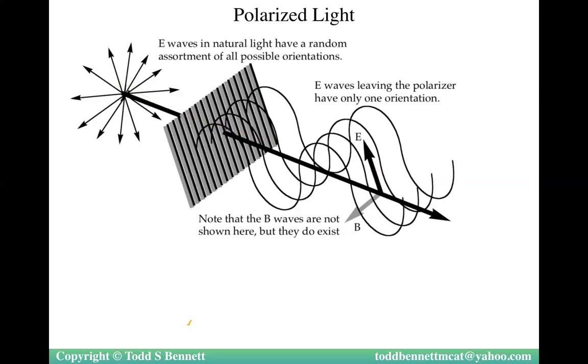We send that light then through a sample. Now, for whatever reason, materials, because of their asymmetric nature versus symmetric nature, if they're asymmetric, they interact with light asymmetrically. If they're symmetric, they interact with it symmetrically. And so if you have a polar compound, no big deal. If you have something that's non-polar, no big deal. But if it's optically active, that's what we're going to look for.